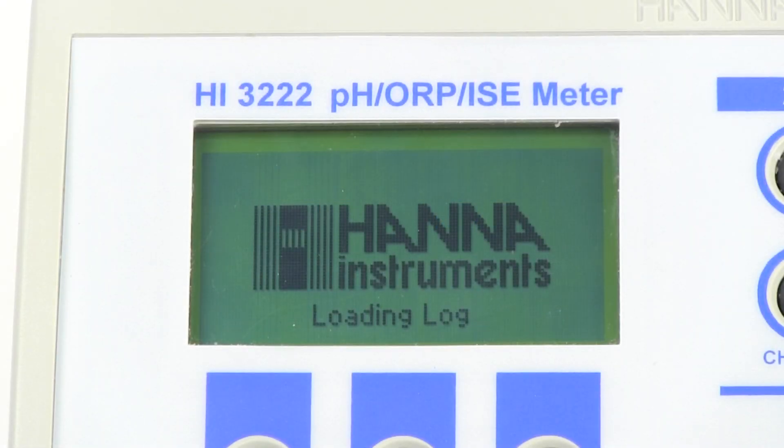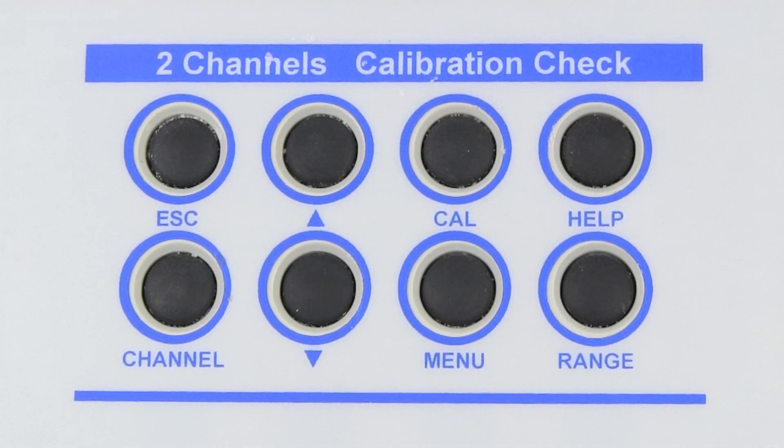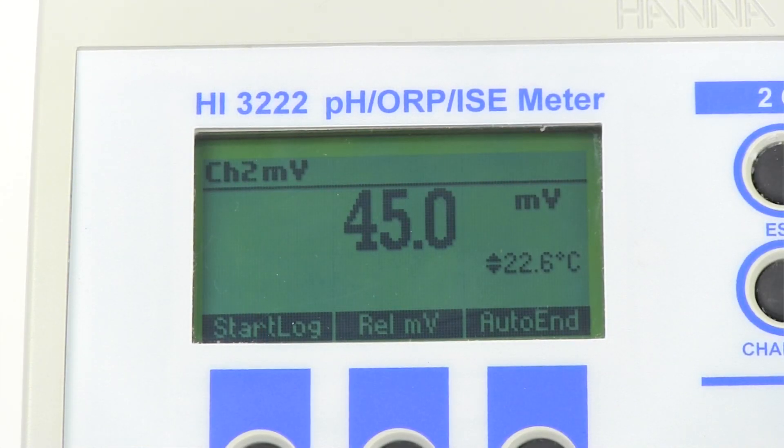First, power on the meter, then press range to access the millivolt mode. Then, carefully submerge the electrode into the pH 4 buffer. Once the millivolt reading is stabilized, record this value.